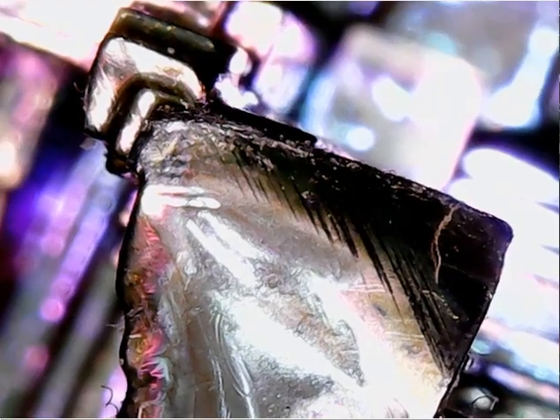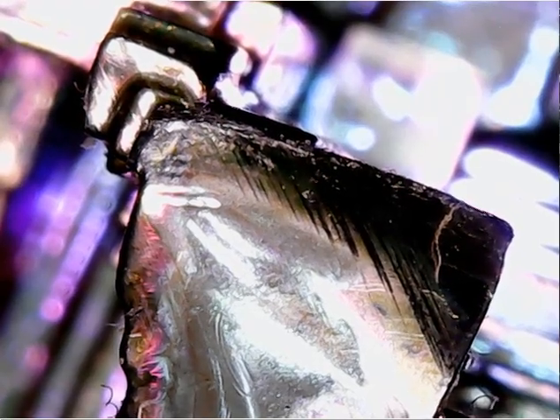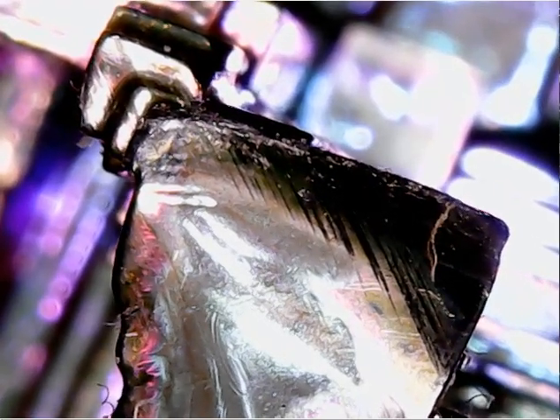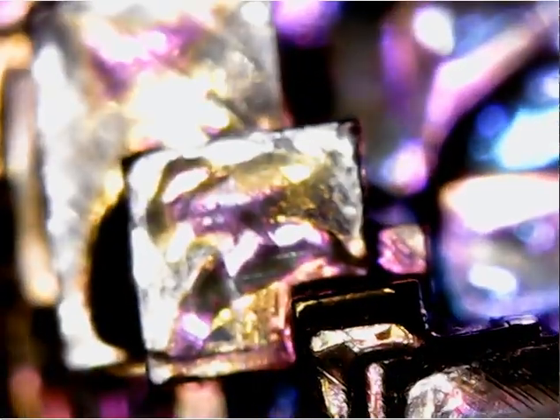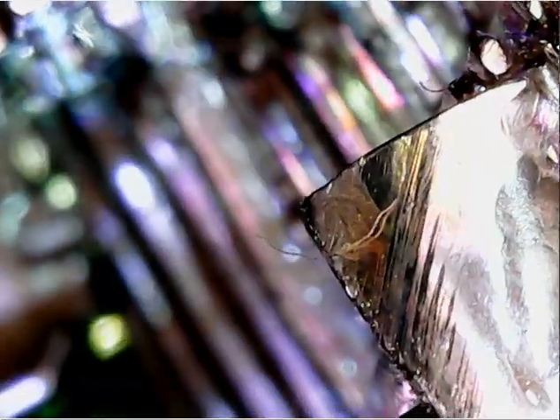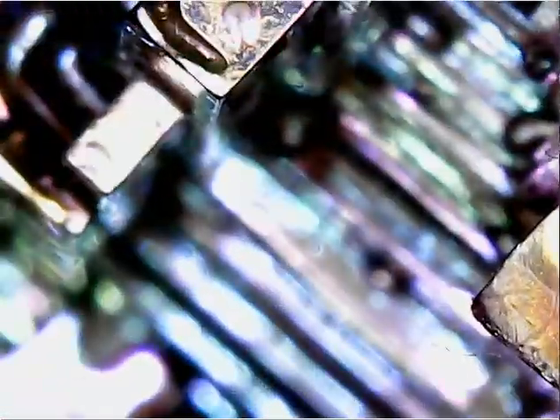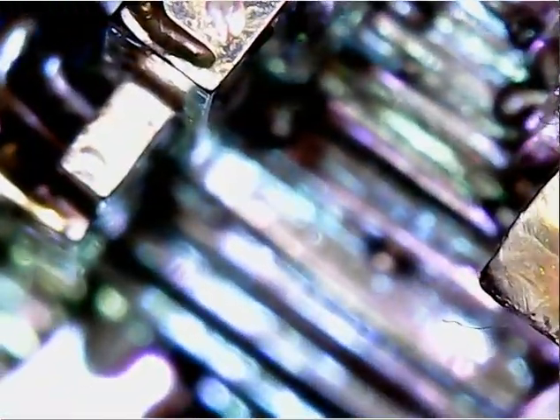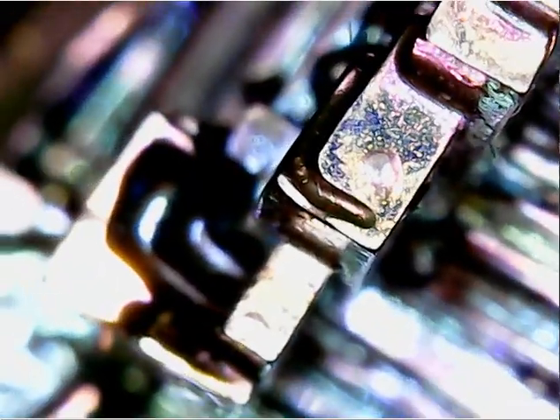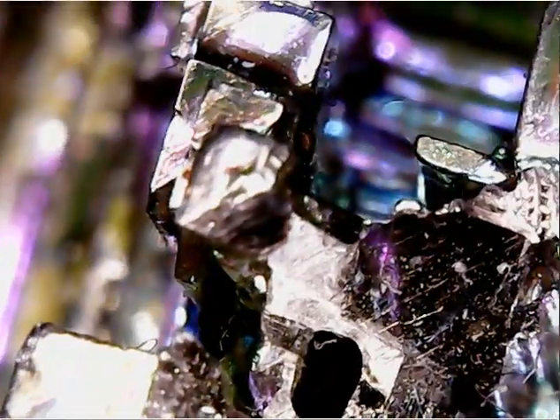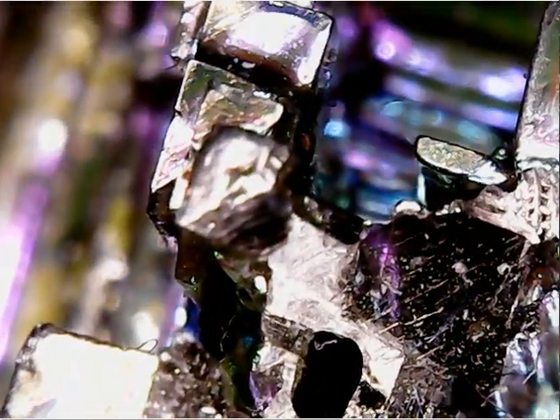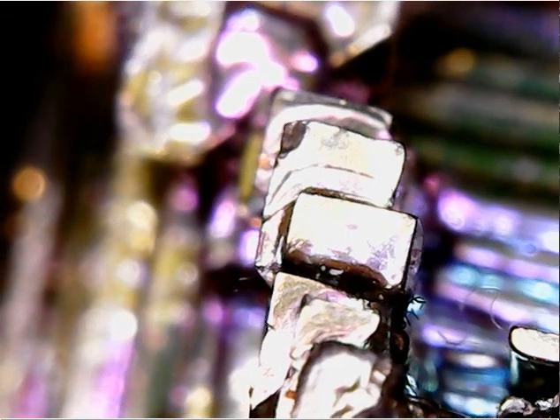Here we have bismuth, it's a metal. It's going to be out of focus because it's a 3D object. It's very hard to put a 3D object under a microscope. You basically get one layer that's in focus, one layer.